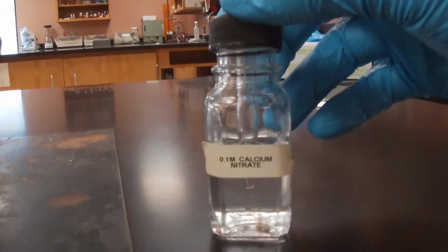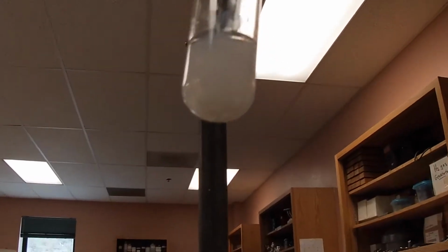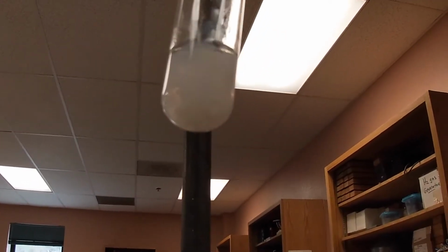And so again, this is a reaction of calcium nitrate and here we have sodium phosphate. Okay, so now your job is to determine one: it did precipitate, so now you have to determine what that precipitate is.